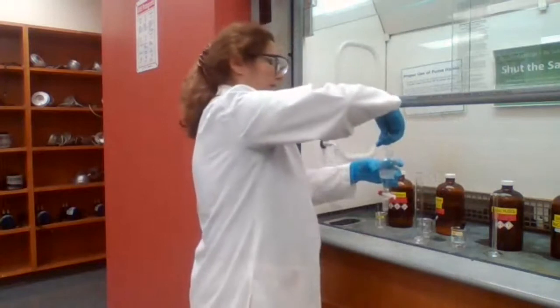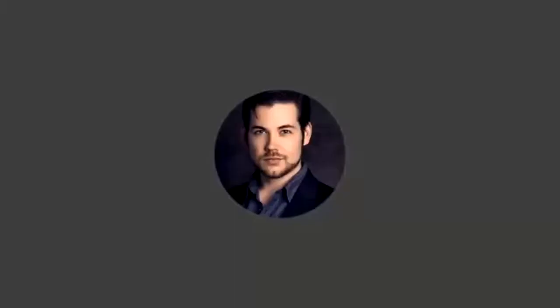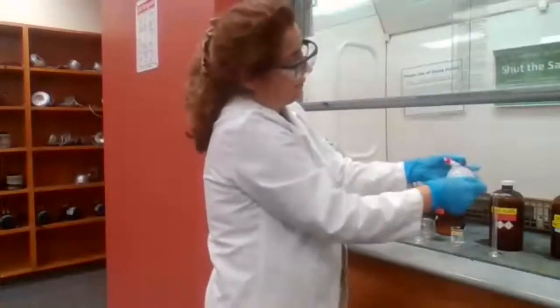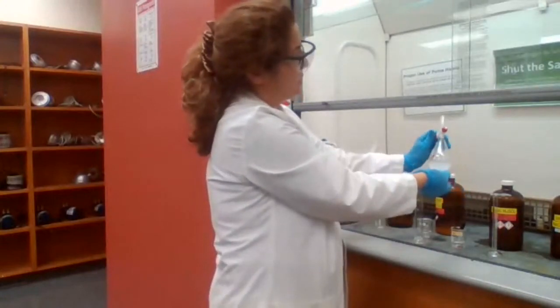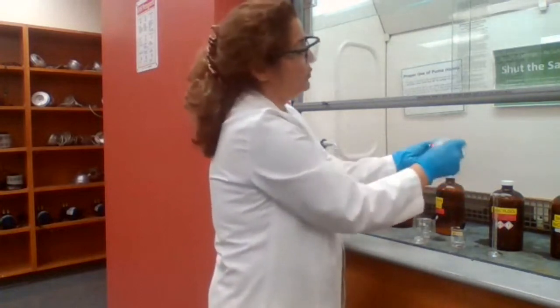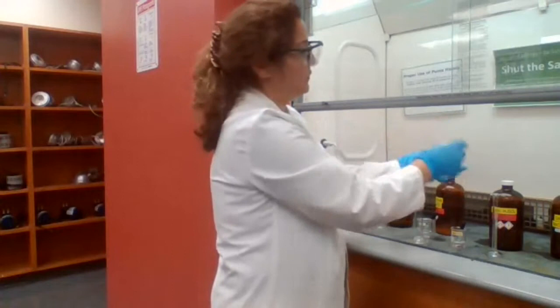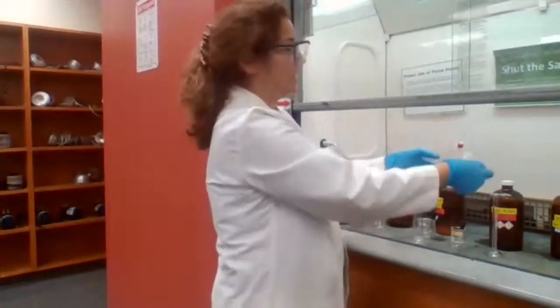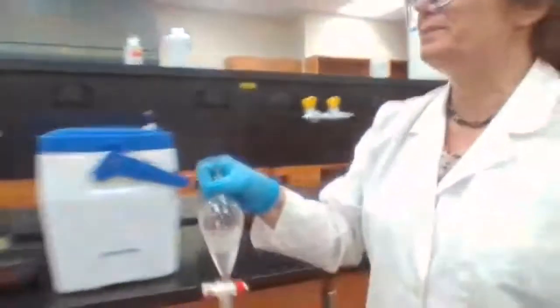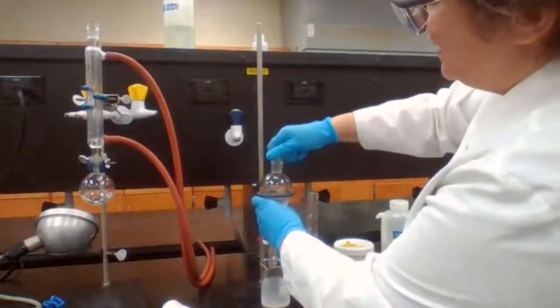What's the purpose of adding sodium bicarbonate again? It gets rid of the excess unreacted benzoic acid. Because it's an acid-base reaction, it will produce carbonic acid, which decomposes and can create more carbon dioxide. It depends on how much leftover benzoic acid we have. If you don't have much benzoic acid, the reaction is not going to be very significant, and you don't see a lot of gas being produced. I guess those extra minutes that we had with the reflux did help with the complete reaction. Okay.